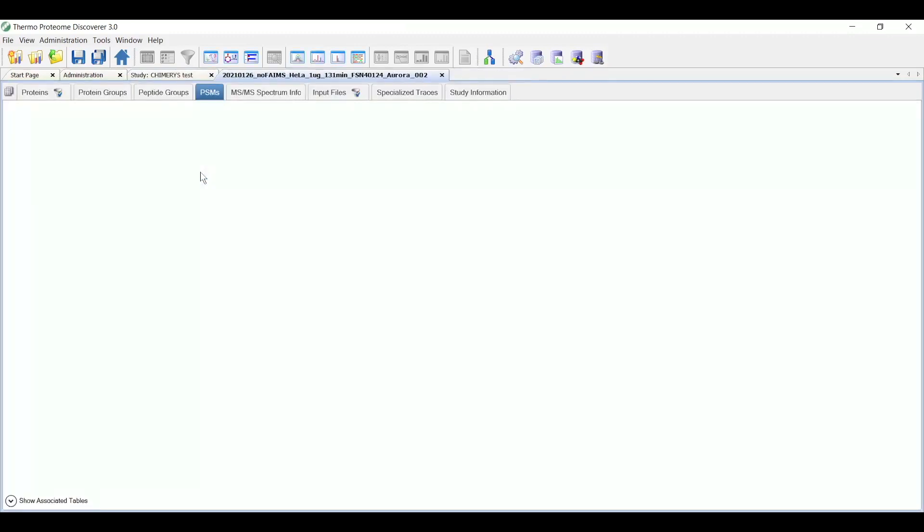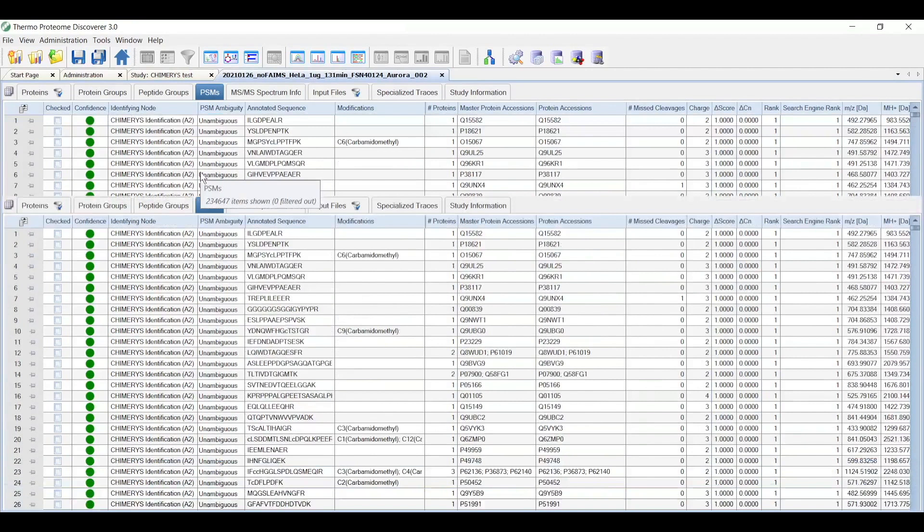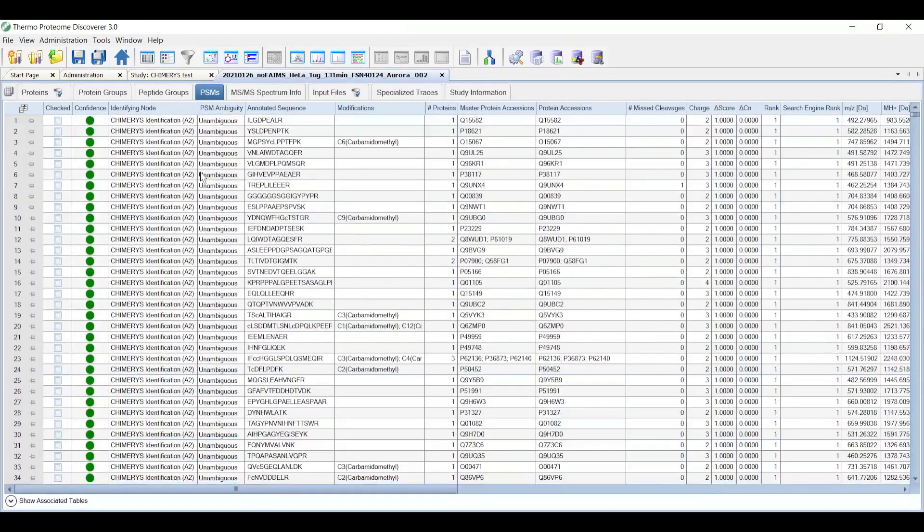As you can see, the result report shows up here, and here's the list of all the PSMs in the dataset.